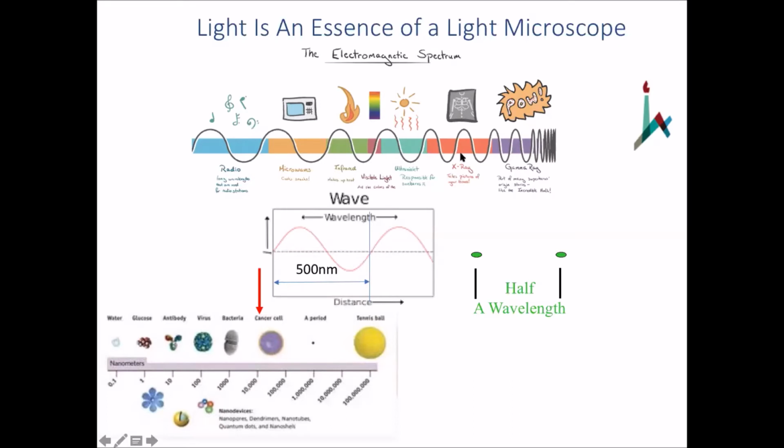Now, the bottom line is that if you want to look at higher and higher resolution, you can go into the X-ray regime, and then you get very high resolution. You can even see specific atoms and their separation, because copper radiation, for example, that means radiation from a copper target, okay, is in the 1 angstrom range.